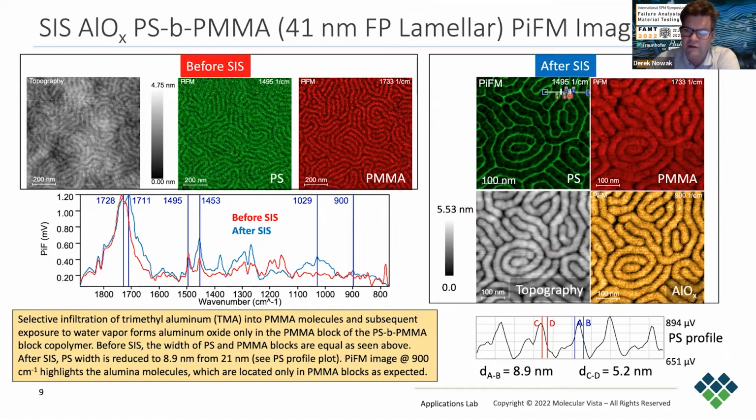Now if you look closely at the PS image here, you can see that we're getting into resolutions that are below 10 nanometers. In this particular case, we're seeing down to about 5 nanometer resolution of that material. And I think CD, that was done like one of these 90-10 ratios on that edge to approximate that resolution.